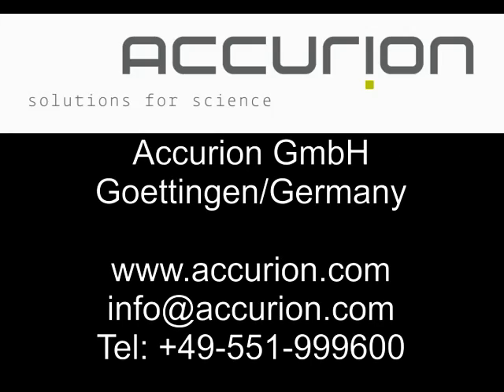We would like to thank you for your interest in our EP3, and for further queries, please do not hesitate to contact the Nanofilm team.